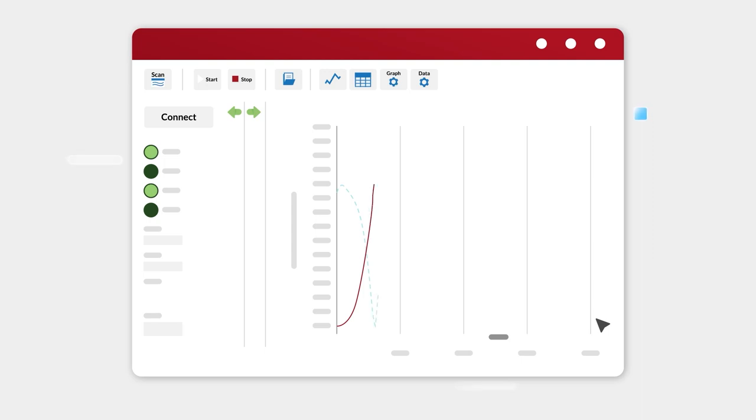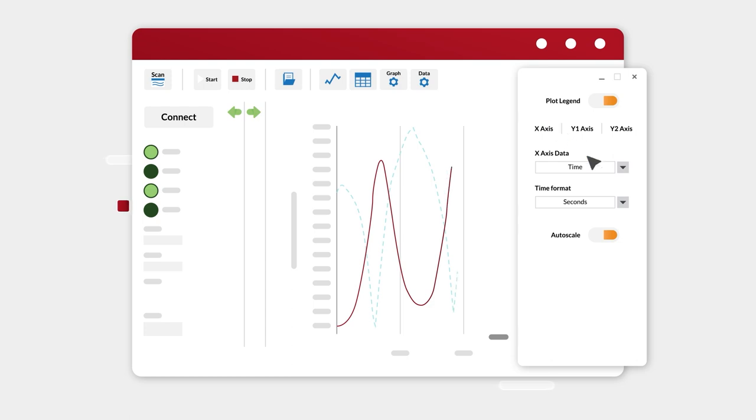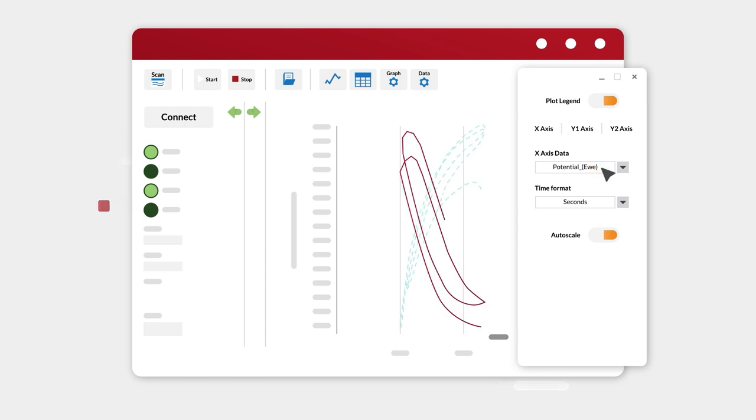EGA Soft enables researchers to visualize their electrochemistry and mass spectrometry data in real time, enhancing the efficiency of the data analysis and ultimately the workflow.